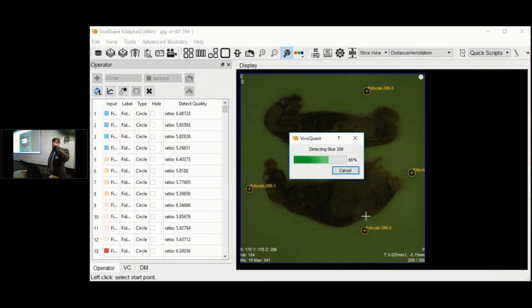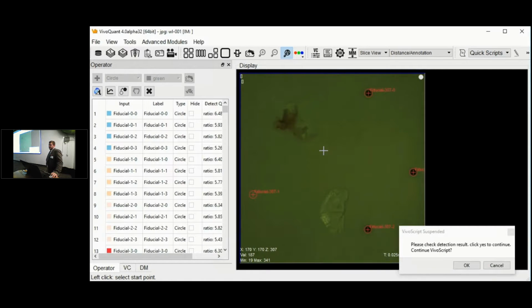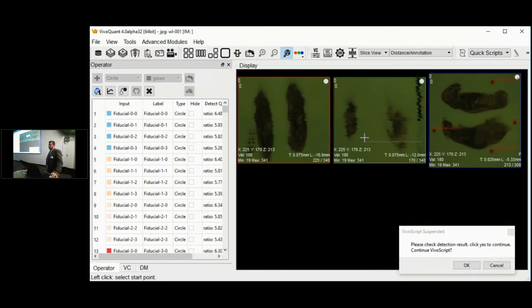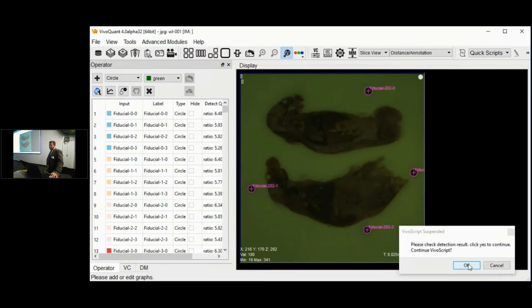White light cameras tend to be extra sensitive in the green, and when you read directly from them, they appear artificially green. This is something that we're going to see corrected a little bit down the road. Okay, so quick QC step. Do these images have all of the fiducials identified where you think they are? Yes. So we keep it going.